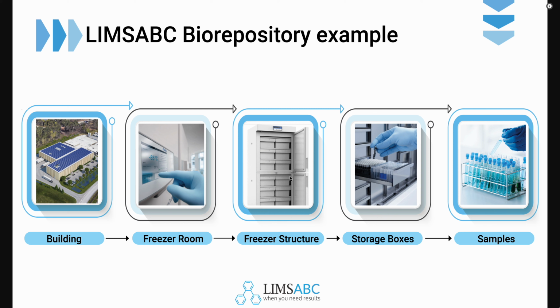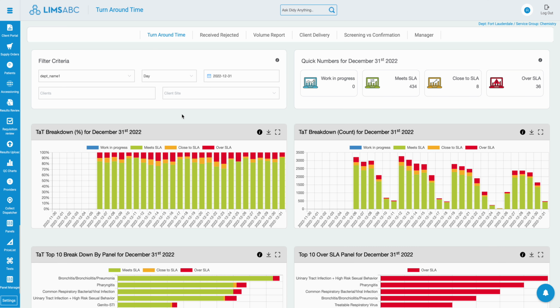LIMS allows you to define a very configurable and flexible location system. With that, I'm going to switch to the application, and I'm going to show some of the most basic configuration and then go into the actual biorepository.